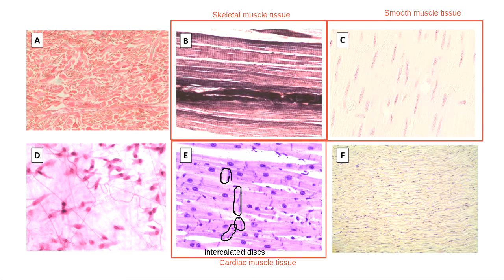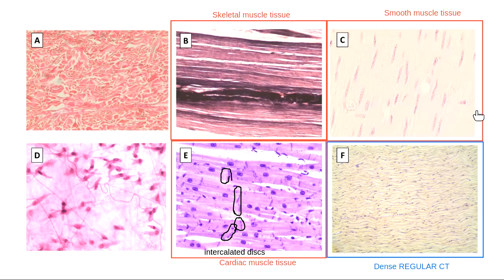Yeah, so this is a type of connective tissue, which is why I made it blue. This type of connective tissue that I'm seeing down here is called dense, regular connective tissue. Actually, I'm just going to put C because I'm feeling lazy. Dense, regular connective tissue. Okay, this is dense, regular, and this is smooth muscle. I want you to make a note for yourself. Please make sure that we are good at distinguishing between smooth muscle and dense, regular connective tissue.